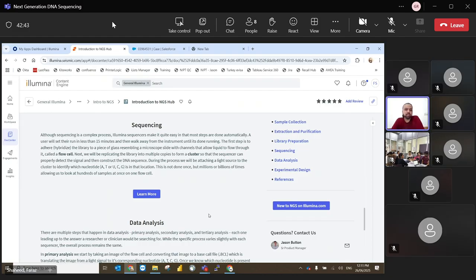But these days, actually, Illumina uses only 2 colors to identify 4 bases, and it is done by 2-channel chemistry because there are 2 different cameras. One works in the red laser, another one in the green laser. So I'll not go into much detail how the machine works, but you can identify 4 bases by 2 colors as well.